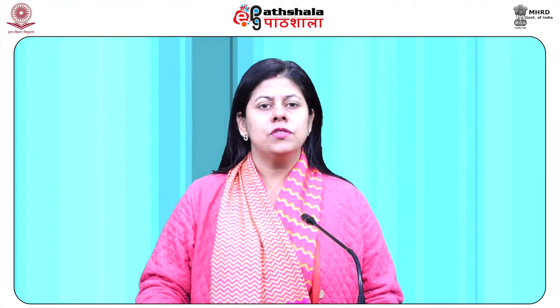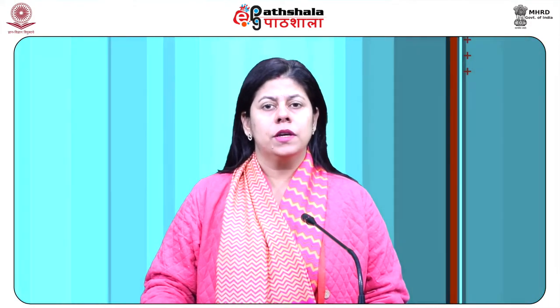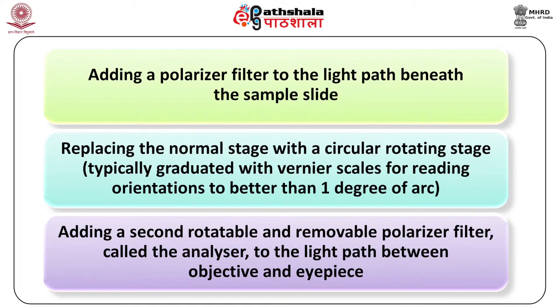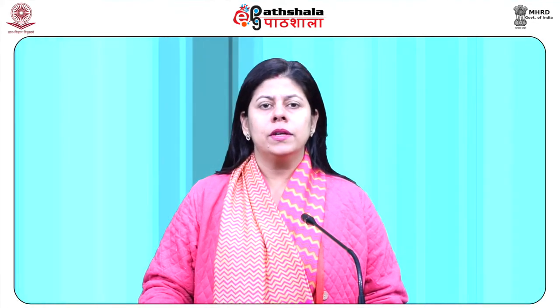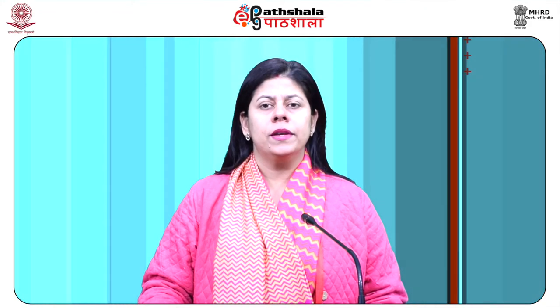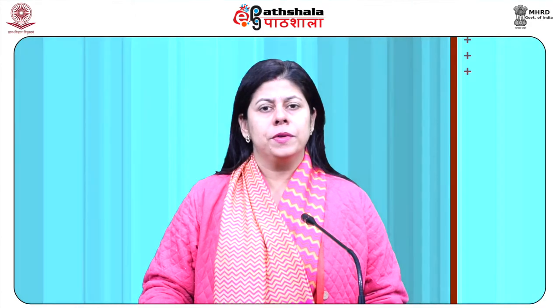Depending on the grade of observation required, petrological microscopes are derived from conventional bright field microscopes of similar basic capabilities by adding a polarizer filter to the light path beneath the sample, replacing the normal stage with a circular rotating stage, typically graduated with a vernier scale for reading orientations to better than 1 degree of arc, and adding a second rotatable and removable polarizer filter called the analyzer to the light path between objective and eyepiece. Petrographic microscopes are constructed with optical parts that do not add unwanted polarizing effects due to strained glass or polarization by reflection in prisms and mirrors.